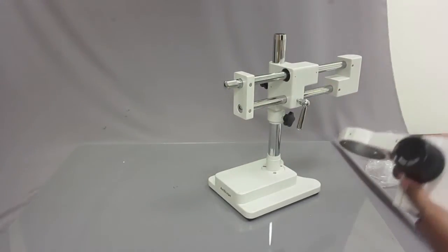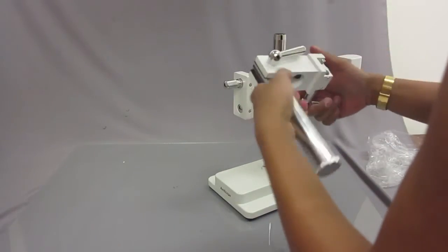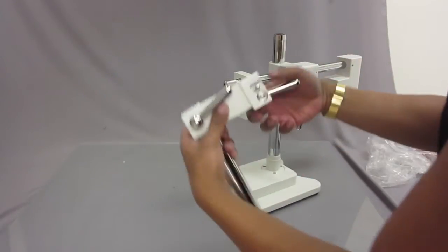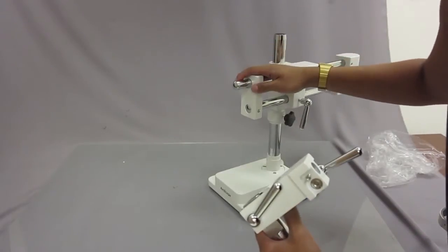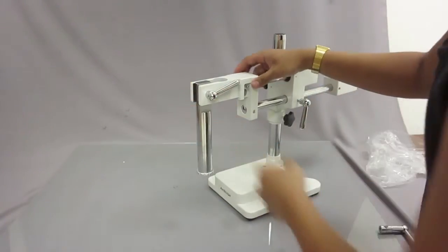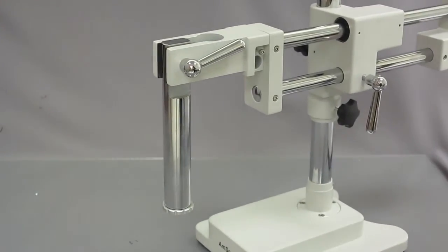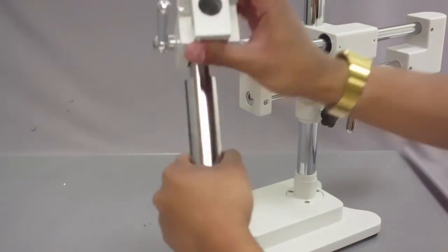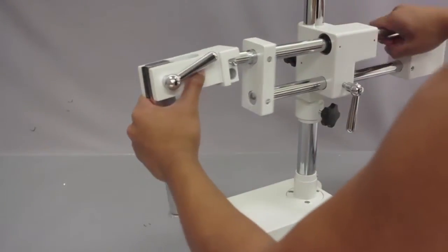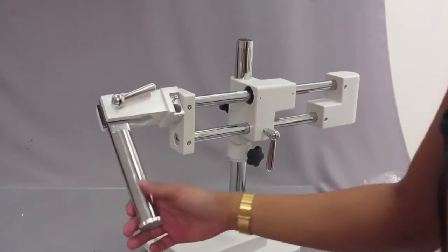This next part is going to hold the focusing rack of the microscope. The first thing you have to do is take this part and attach it right here in the front — it goes in quite easily. This part has a screw, and you're just going to go ahead and place it right here.